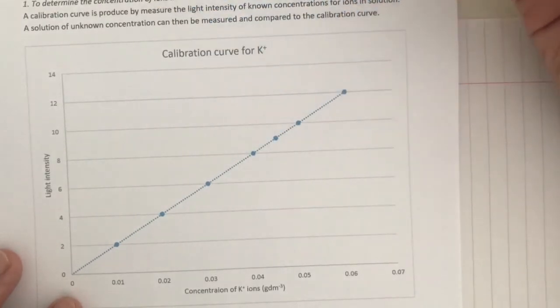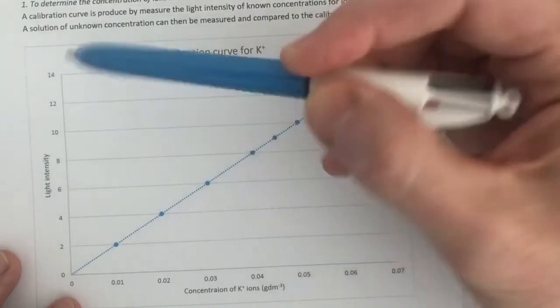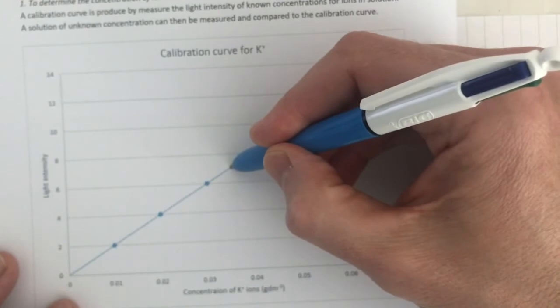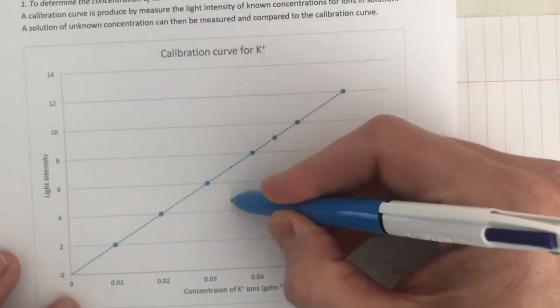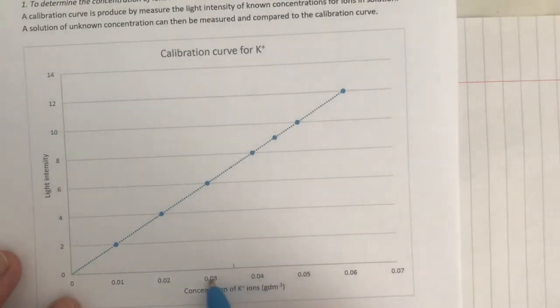For example, if I had a light intensity of 7, I would find 7 here as my reading. I would draw a line all the way back to the calibration curve, which is here, and then I would take a line all the way down, and you can see, just doing it very roughly, that this is sitting halfway between 0.03 and 0.04 grams per decimeter cubed, in this case, of potassium ion. So it's going to be 0.035 grams per decimeter cubed of potassium ions, just using the calibration curve to find that out.